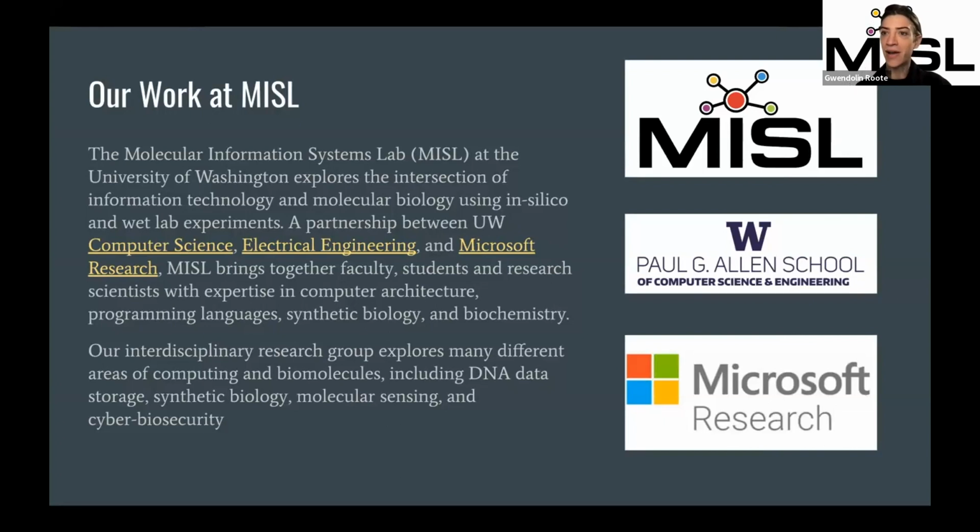One of our original PIs, Luis Ceze, and his wife, Karen Strauss, who is at Microsoft Research, decided to create an institution to study the integration of biology, synthetic biology specifically, with computer science tools.